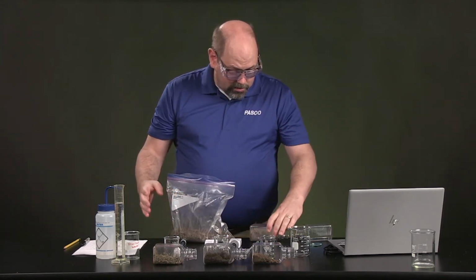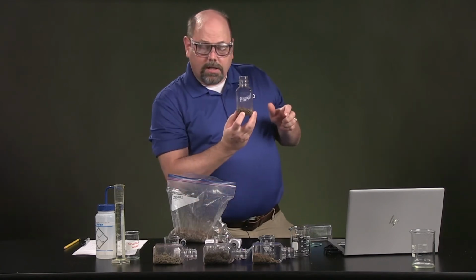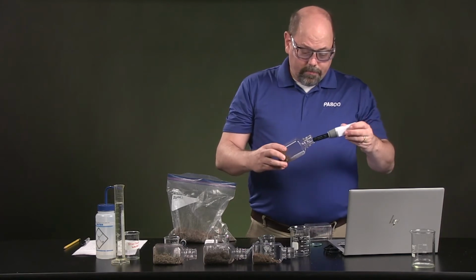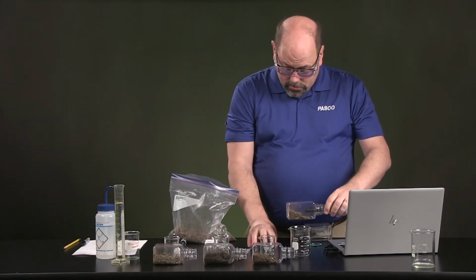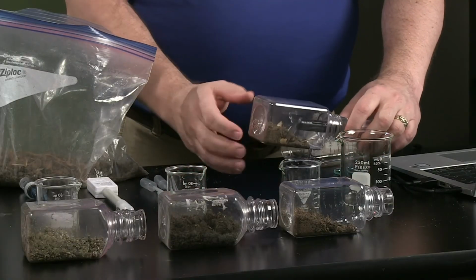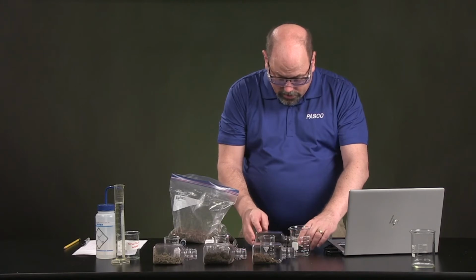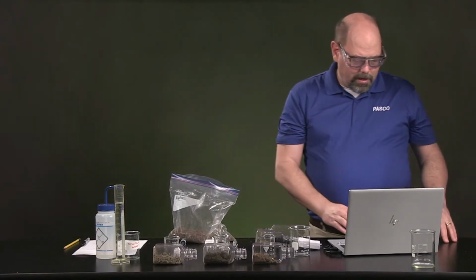Next, we're going to put into here about 40 mils. The bottom mark here is about 50, and you can see I've done that. And then we're going to take our CO2 sensor and put that in here. We're going to follow the CO2 amount. I'm going to get it nice and flat across the bottom so that any CO2 that's generated will have maximum surface area for the CO2 to escape and be measured.